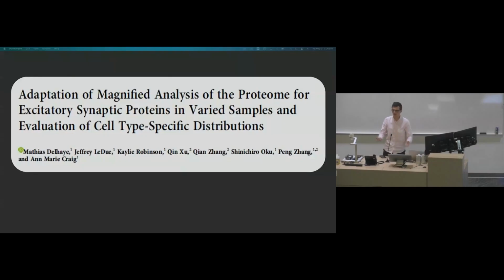So we gathered all of this troubleshooting in this paper that has been recently published. As I was mentioning, there is a protocol for employing expansion microscopy, the magnified analysis of the proteome, very detailed step by step, and also how to stock the different stock solutions. I hope this could help people to implement this procedure if needed. Once it's troubleshot, after a couple of weeks or months, you can start getting reliable results out of this protocol.